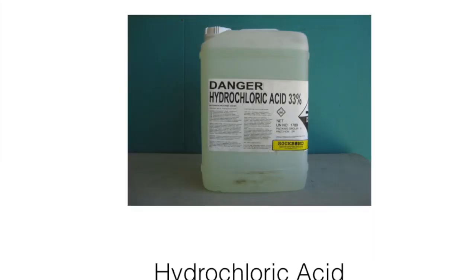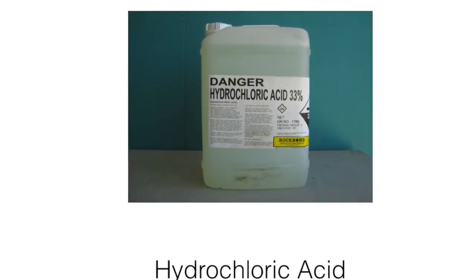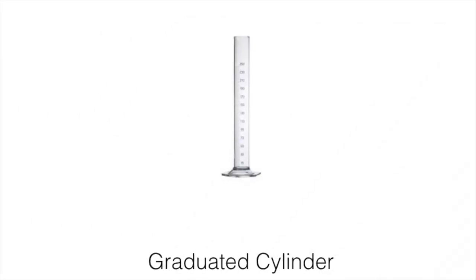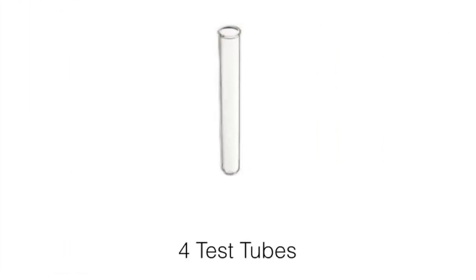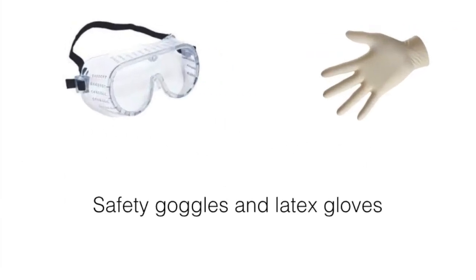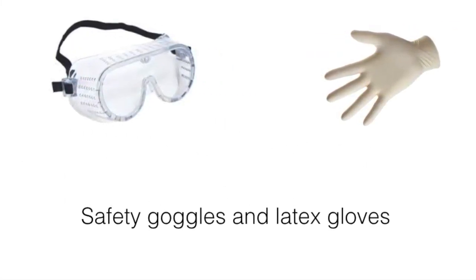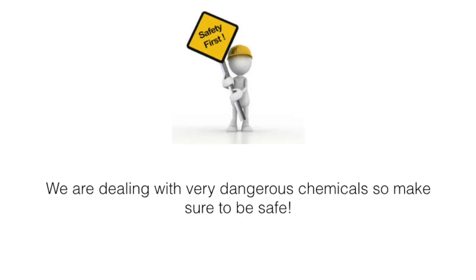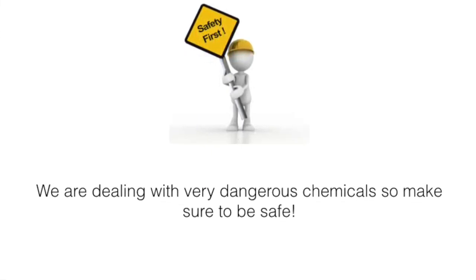What you will need for today's experiment: hydrochloric acid, carbon rods, magnesium metal strips, calcium metal, aluminum foil, a graduated cylinder, 4 test tubes, safety goggles, and latex gloves. And make sure you're with a parent or adult. And most importantly, safety first.